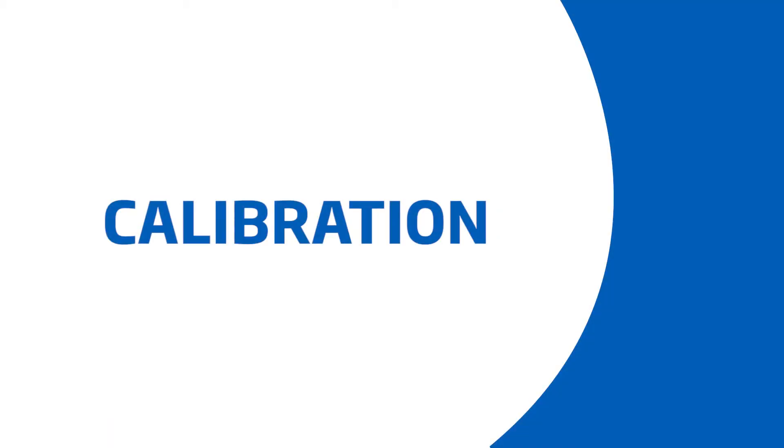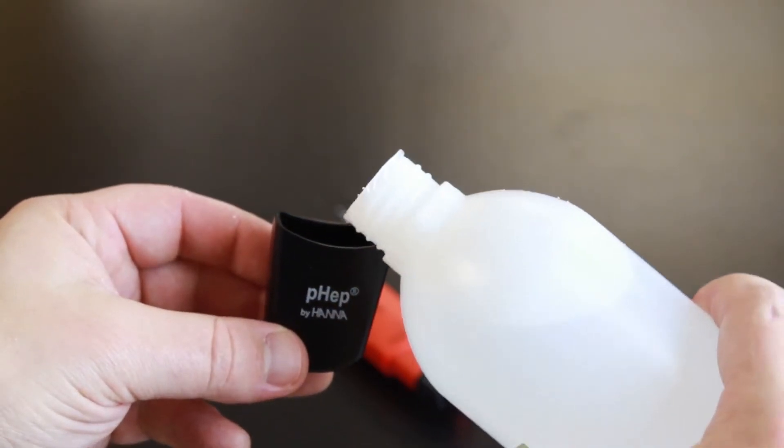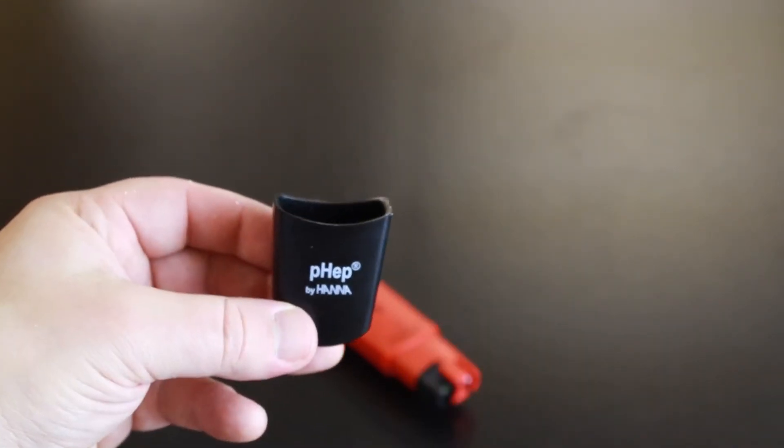Calibration is an important part of keeping your tester operating at its best. We recommend calibrating before each use. When you're not using your tester, we recommend you keep it in pH electrode storage solution, your HI70300. If you don't have storage solution, pH 4 buffer works too. Without proper storage, the electrode gets dehydrated. We recommend you rinse and store your electrode after each use.